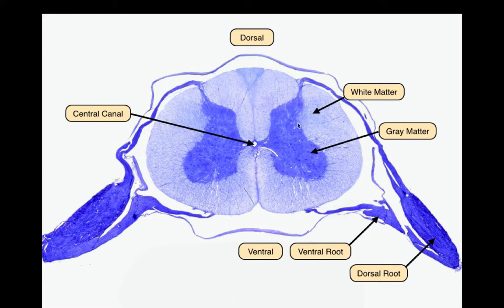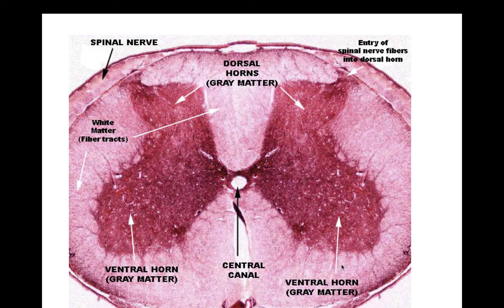So this is going to be your posterior horn, lateral horn, and anterior horn. If you have the dorsal root right here, you know this is the dorsal side of the spinal cord, so this is going to be the posterior horn and the ventral horn. Here again we have the ventral horn, the dorsal horn, and here is the anterior median fissure.